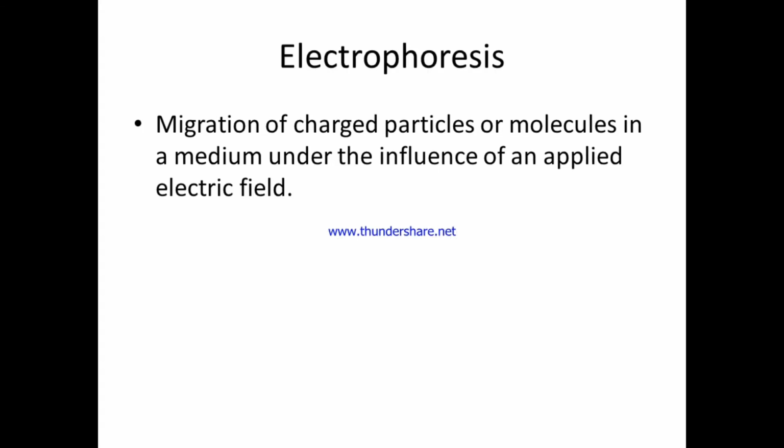Let us begin with the definition of electrophoresis. Electrophoresis is migration of charged particles or molecules in a medium under the influence of an applied electric field.